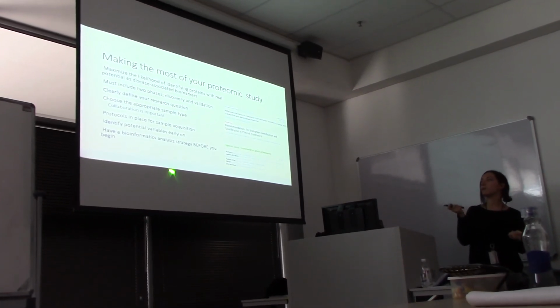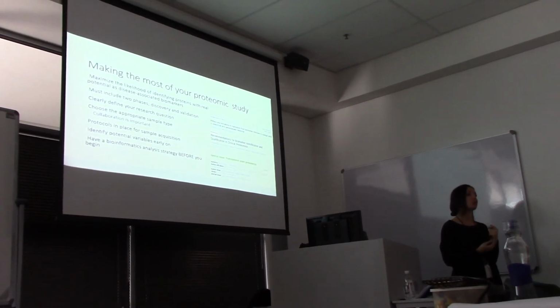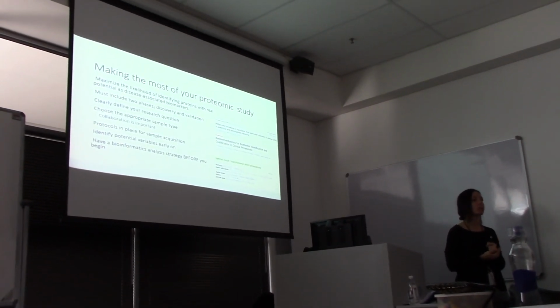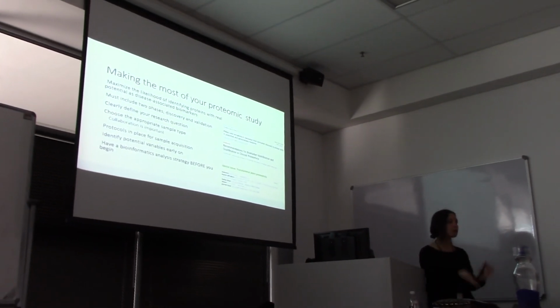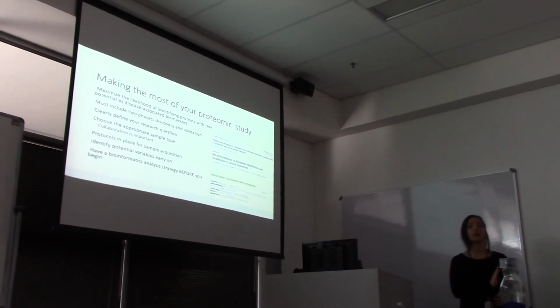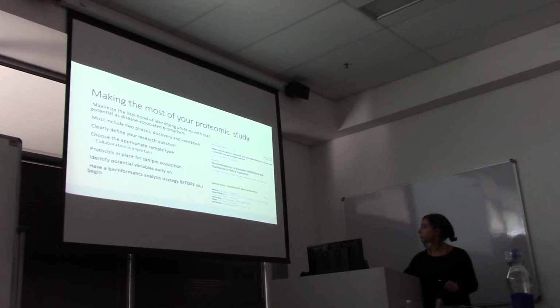As I've said, have your bioinformatics strategy before you begin. That's really important so that you know what you're doing downstream. It's so hard to deal with your proteomics data. If you know, I'm going to follow this strategy, I'm going to filter out my proteins like this, it just makes for a much better time, honestly.